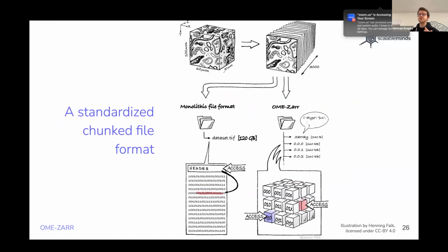What it does is, if you look at the way traditionally these files come to be from a microscope, right? You have your sample, you put it in a microscope, you get out these sectional images. And either this is like a TIFF stack, or it's a single big TIFF image. Now you have that, but the way these files are stored is not really optimal for some of the use cases that you might want, like interactive visualization with virtual cross-cutting, or even three-dimensional processing on an HPC or something like that. So it's really not well designed for that.